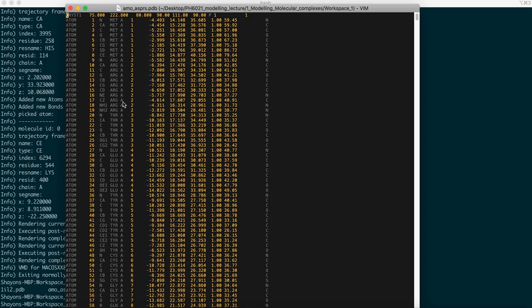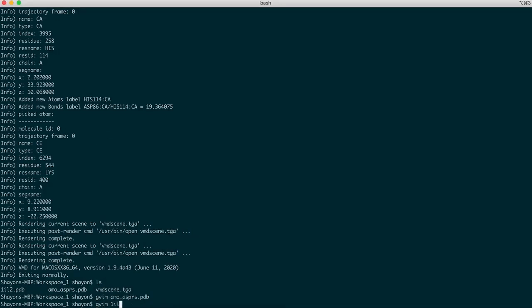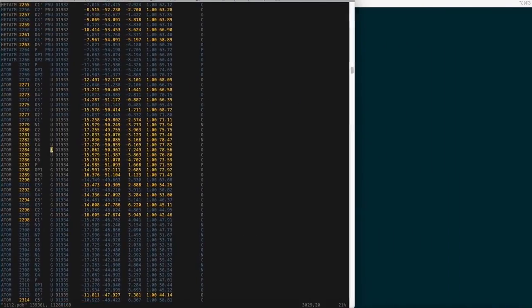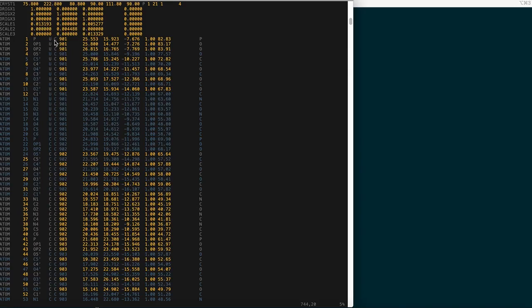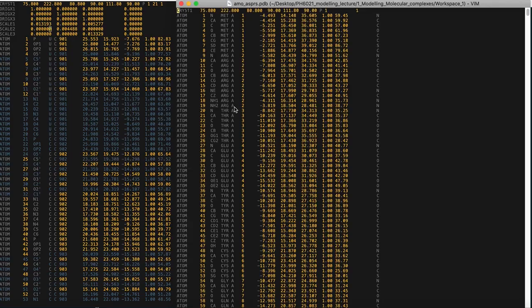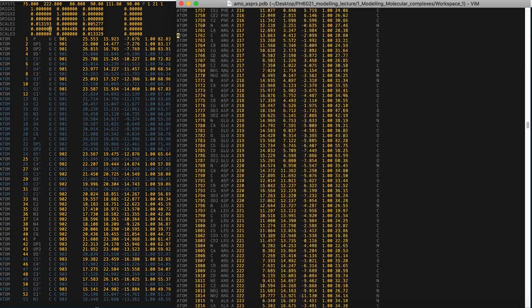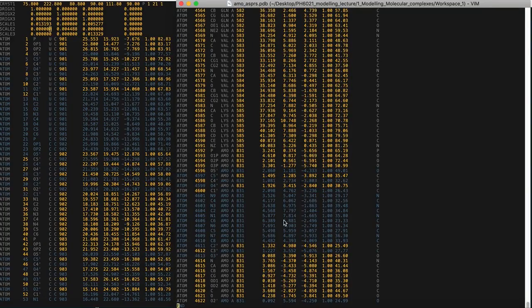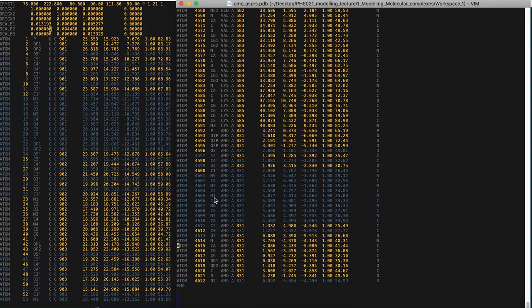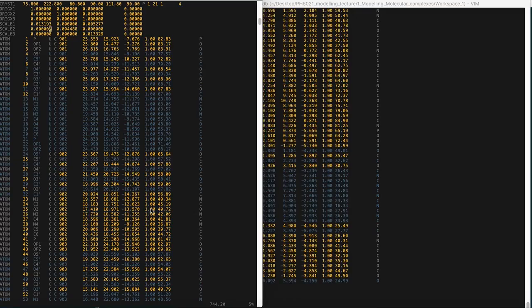As you can see, it only has the chain A here, whereas if you compare with the previous structure in the text format, you'll find there was a lot of different things written on top in the first place, and it started off with chain C. Yes, you can see it here. It's chain C, starting off with chain C, with the first atomic position, whereas in the newly built structure that we have here, it starts off with chain A and then goes further down along. I'm going to quickly scroll through this file towards the very end, and you'll see that it ends with chain A, and the new molecule that's here, the ligand, that's AMO, that's also saved. Everything else that was there in the other PDB file that we opened in the text format is deleted.